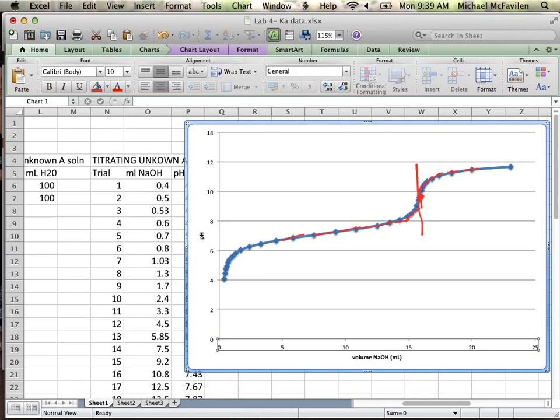What we're trying to interpret is what's known as the point of inflection. I think it's the point of inflection. Okay? If we take a look at our curve, this portion of the curve is concave up. What about the other portion of the curve? Concave down. So what we're looking at is where our data ends up swapping directions of facing.